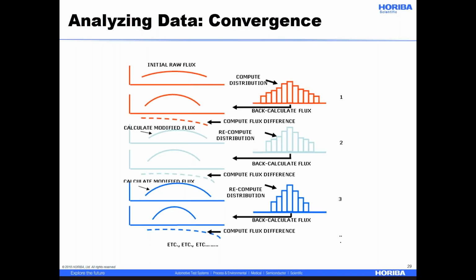Generally, they're all iterative, but you're basically going to start with the initial measurement, estimate a distribution, back calculate what scattering you expect from that first estimate, find your error, and then calculate a new, more refined distribution, calculate the difference, and you go back and forth until the measured scattering matches the scattering calculated from your candidate distribution. So you'll see software taking various approaches to handling these calculations. Generally, you'll want to turn off the automated approaches as you lock down a method.